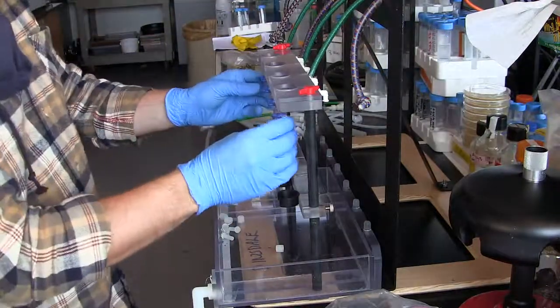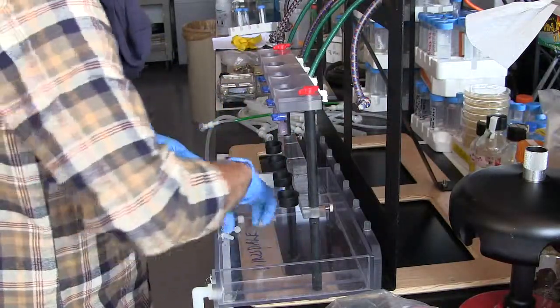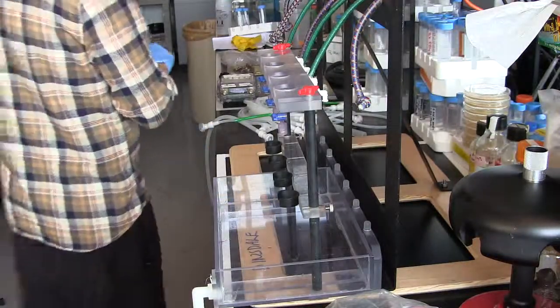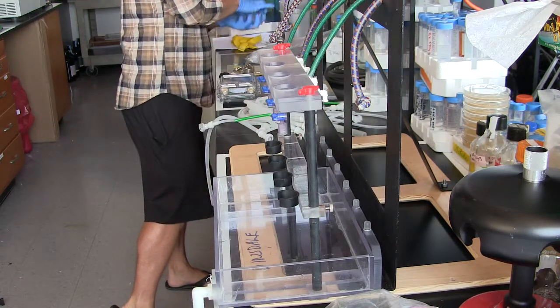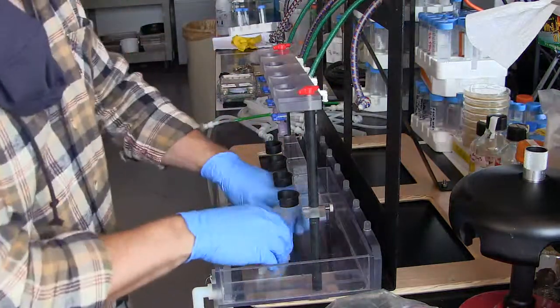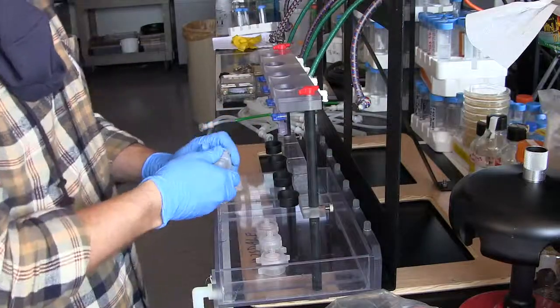Okay, so right now we have the outlets for where the water will flow through. Let's keep all of our little pieces together. Try not to lose them or get them contaminated in any way. Then we take our filter holders, and we're going to do 4 of these. Remember, you can double it and have both of these basins operating anytime.